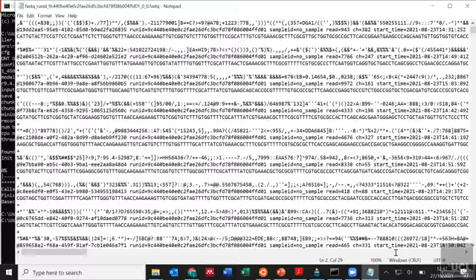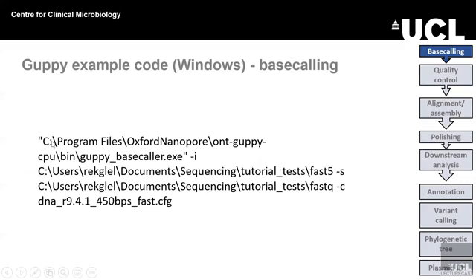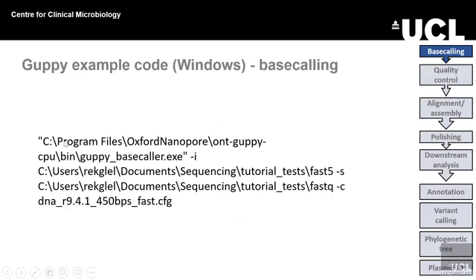Great. So let's go back to this. As I say, this is the Windows version, and this is how Windows likes to have the file addresses written out. I know that Linux does it slightly differently, but I will show you a version of the Linux command line as we go through. If you copy and paste directly from Windows, that will work within the Windows command line.